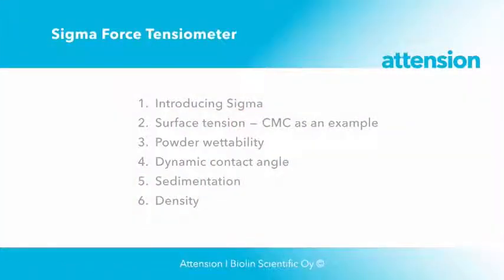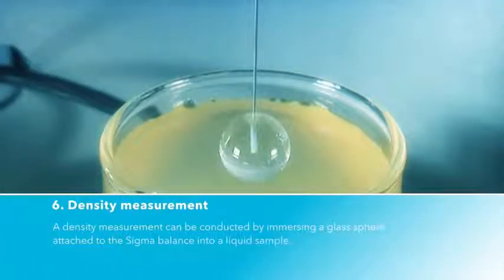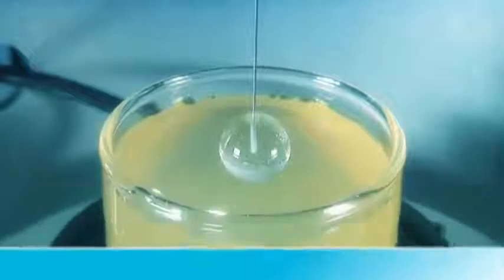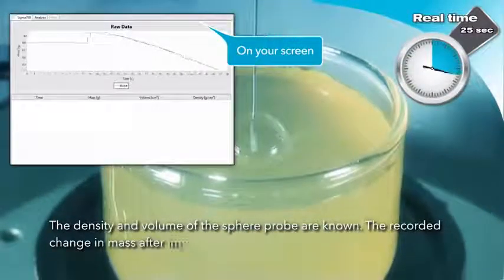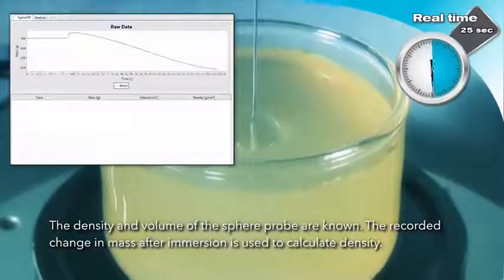And finally, a density measurement. A density measurement can be conducted by immersing a glass sphere attached to the sigma into the liquid sample. The density and volume of the sphere probe are known. The recorded change in mass after immersion is used to calculate density.